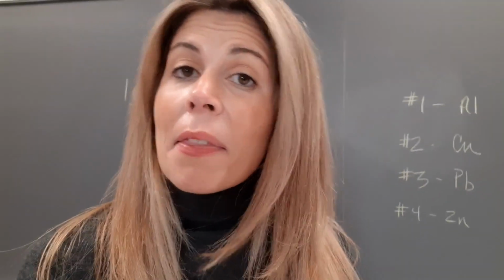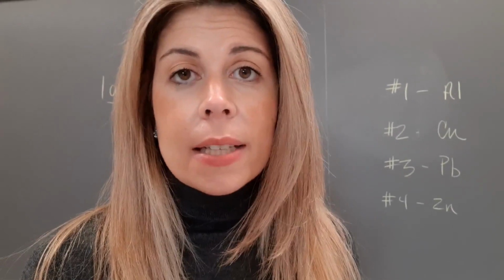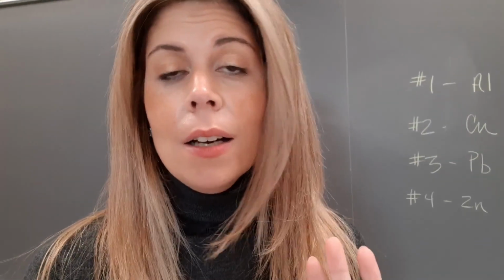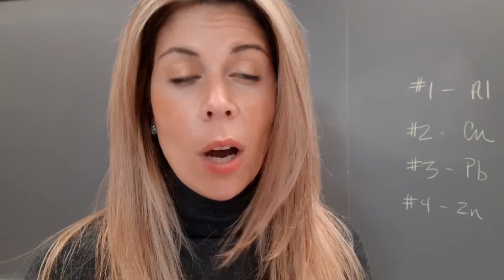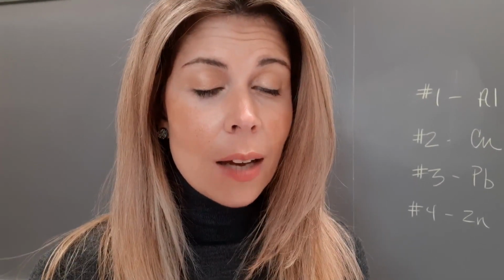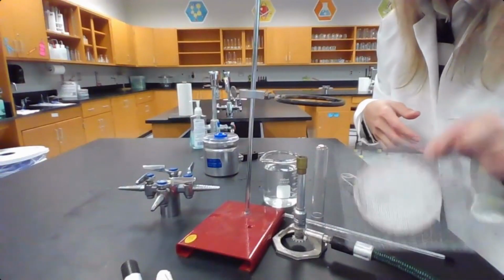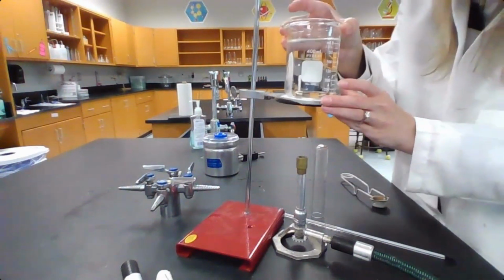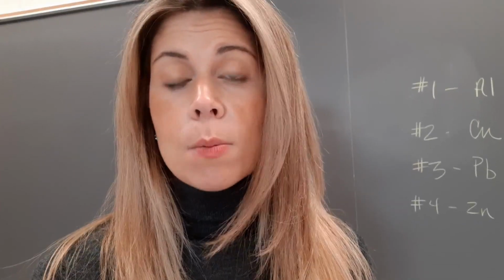I just finished with my lunch, and now I'm back in my classroom, and I wanted to talk to you a little bit about the lab that I did with my AP kids. One of the things that I'm absolutely loving this year is that my students really didn't have an opportunity to do very many labs last year. So to support them and give them extra time to solve problems and ask questions on the lab, I've been making pre-lab videos where the kids are asked, for example, safety questions and questions about the equipment. I spend time showing the experimental setup and talking about disposal, and that has been working so well.